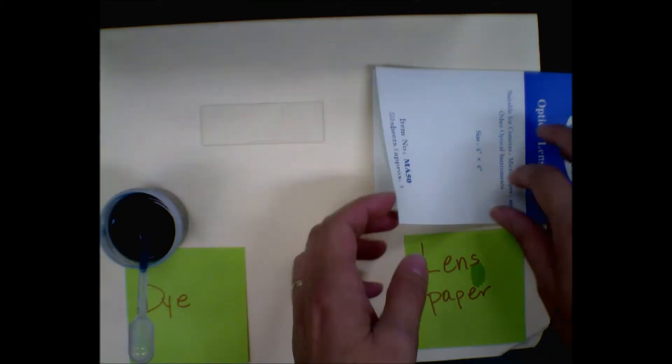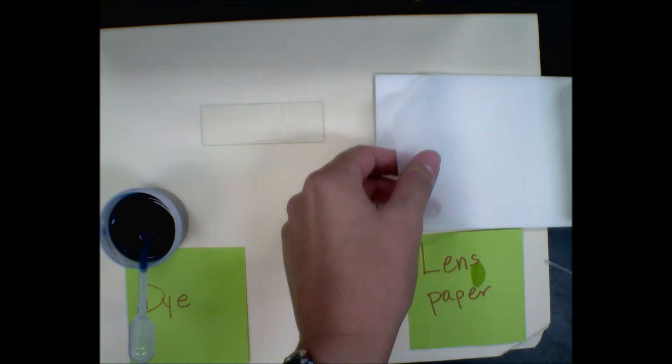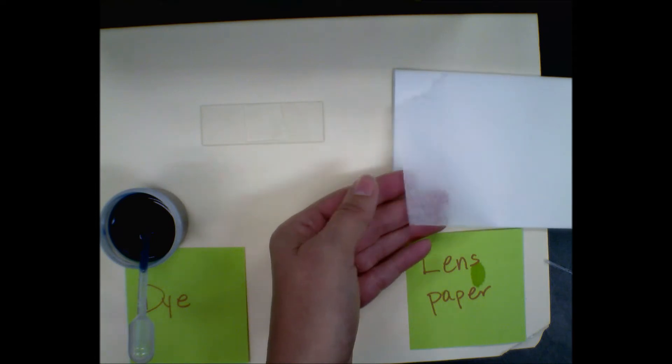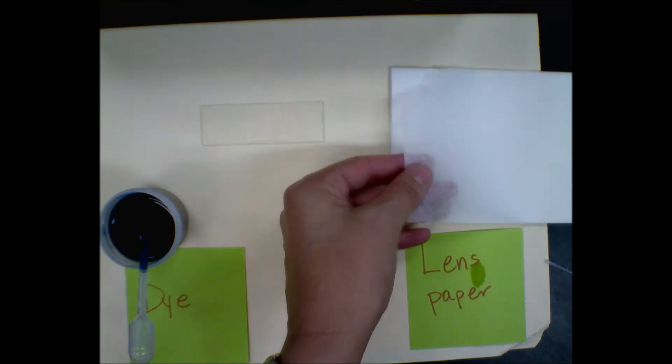We need to stain the cells so that we can see them better underneath the microscope. Lens paper is special paper. It doesn't put any lint on any of your glassware like your microscopes or your slides, so it's very handy in that respect.